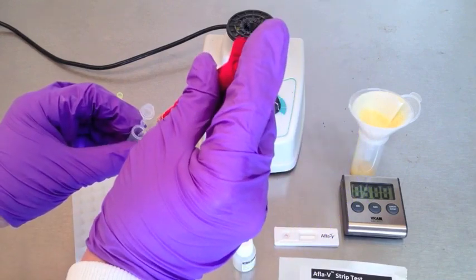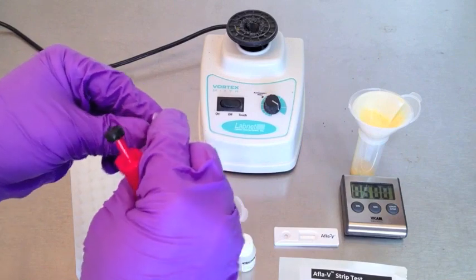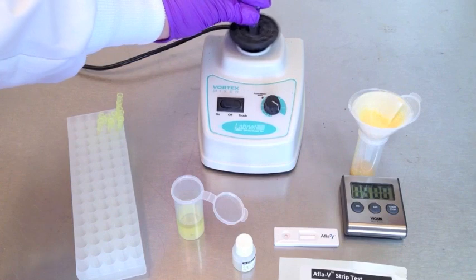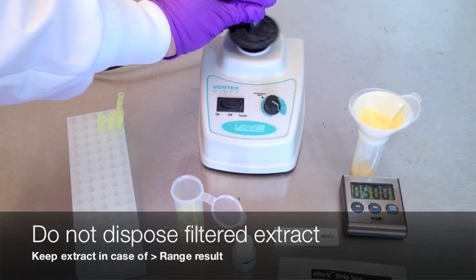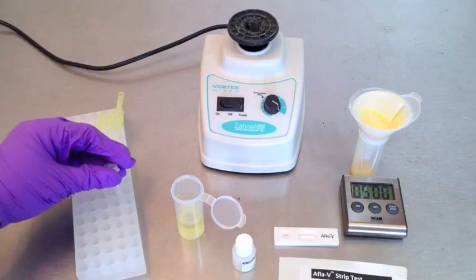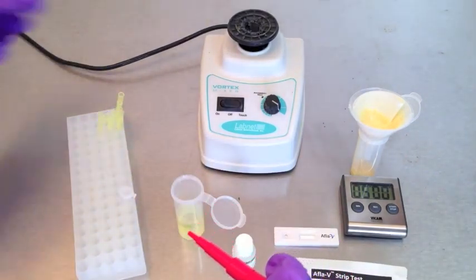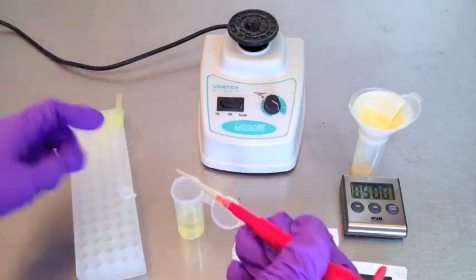Use the same pipette tip to measure the diluted sample. Pull 100 microliters of sample extract, close the vial lid, and mix well by vortexing. Do not dispose of the filtered extract at this time — in case of an out-of-range error, you will be using this filtered extract a second time. Be sure to change the pipette tip.